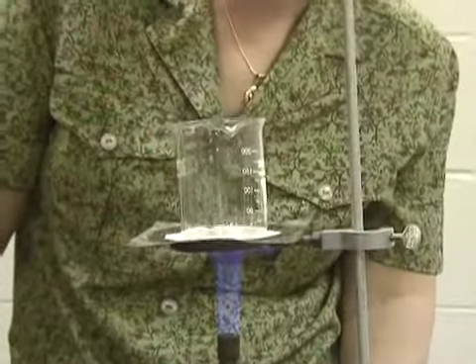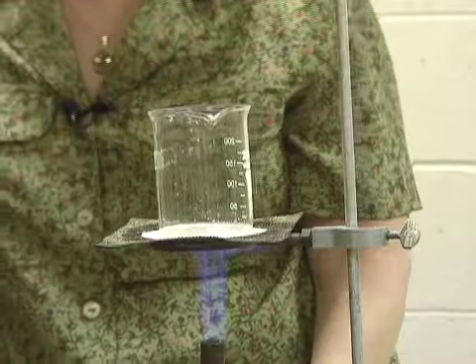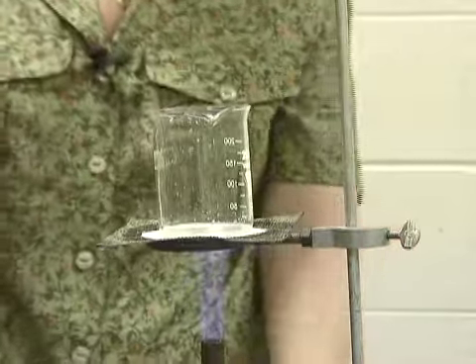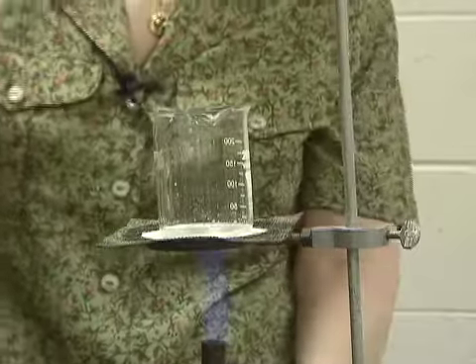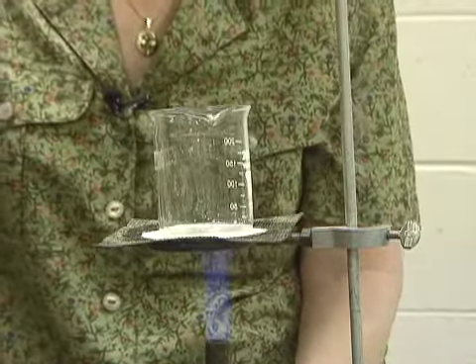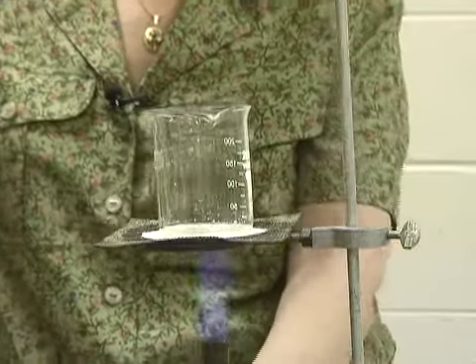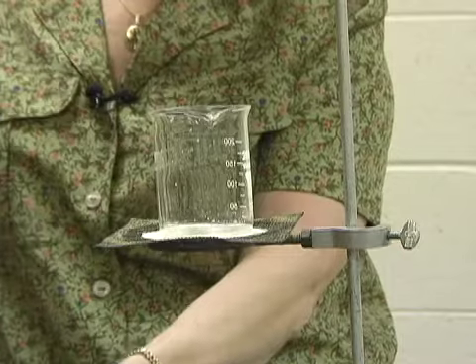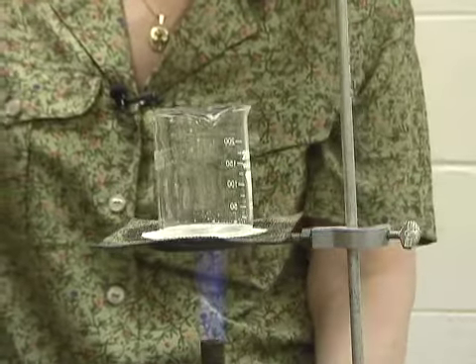And I do see some crystals on the sides of the beakers, the things that have gone up there and attached. I don't want it to boil too vigorously. Turn it down there a little bit. Also, if things boil too vigorously, you can always remove the flame. Just remove the flame from the beaker and that will cool it right down.